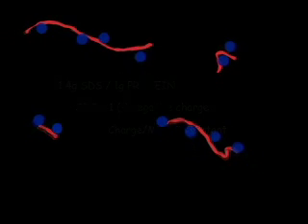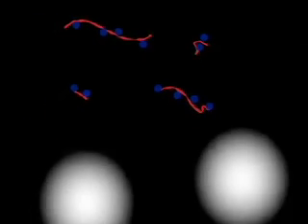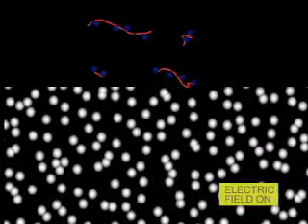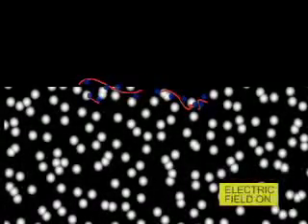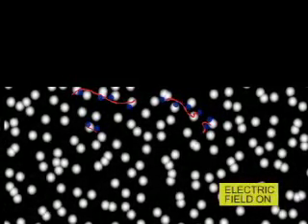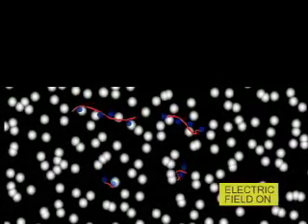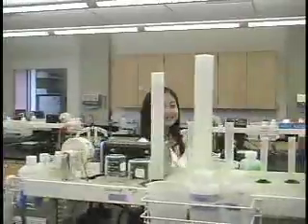The solution is then placed on top of the polyacrylamide gel submerged in Tris buffer. An electric field is applied to the gel, causing the negatively charged proteins to migrate down the gel. What results is a kind of protein race. Depending on their size, each protein will move differently through the gel. Small proteins move the fastest, while larger ones will have more difficulty. After a set amount of time, usually a few hours, the proteins will have differentially migrated, with the smaller proteins traveling farther through the gel, while the larger ones will have remained closer to the point of origin. Thus, proteins may be separated roughly according to size, and therefore molecular weight.